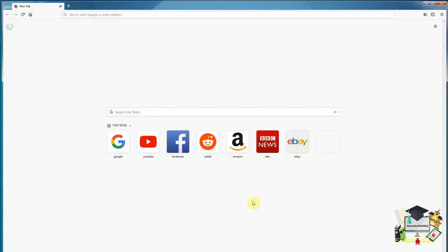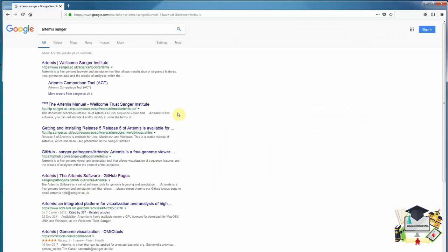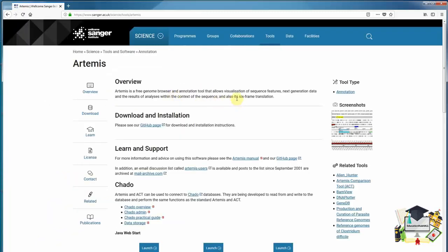The first thing to do is to download the software. To do this, I'll go to my web browser and search for Artemis Sanger. This leads to the top hit, which is the page at the Sanger Institute. This gives brief details of the software and also more advanced details of how to use Artemis. What we need to do is click on the GitHub link to download the software.